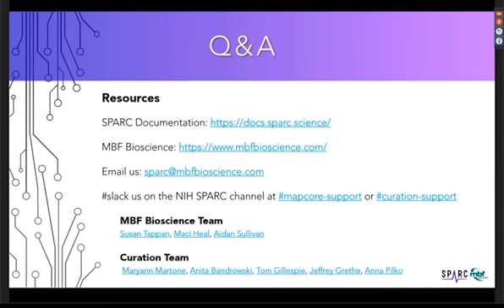Hi, it's Marianne. It sounds like there was a question about what if the organ or study is not in the drop-down list. If that's true, just please let us know, and we will create a term list for you. If you could give us some lead time, it does take a while to assemble the terms and then make them available through MicroBrightField. Any other questions? I think we're ready to wrap up unless anyone has anything else that they want to propose.